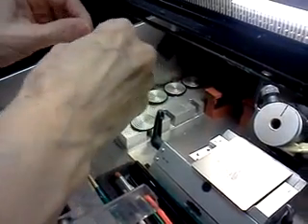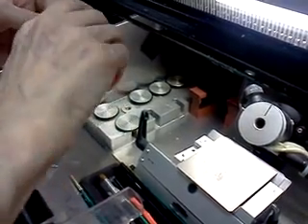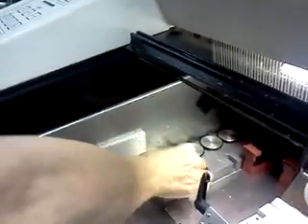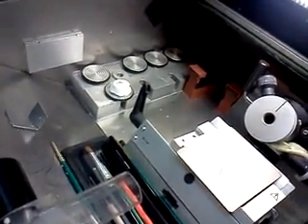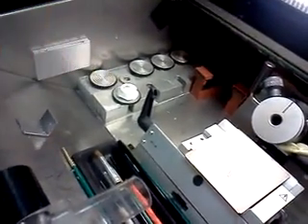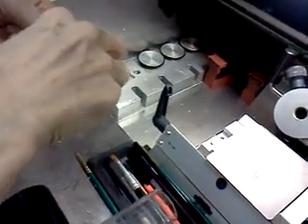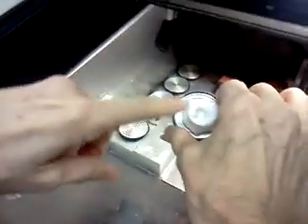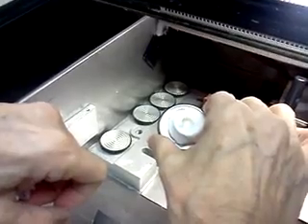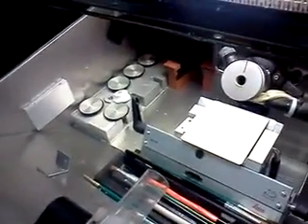I need to freeze them to where they look like that. They're going to look like this. And notice that the size of this is the right size for that block. This would be too small. Okay? Right. That wouldn't work. So that's what we're going to do, put it on there. Now, what I want you to observe is, you see, there's the tissue, the little piece that's in there. And so that's how it looks in there, and you know that you're ready to cut tissue. Okay. So, we are going to set that up. I'll get some gloves on. Okay.